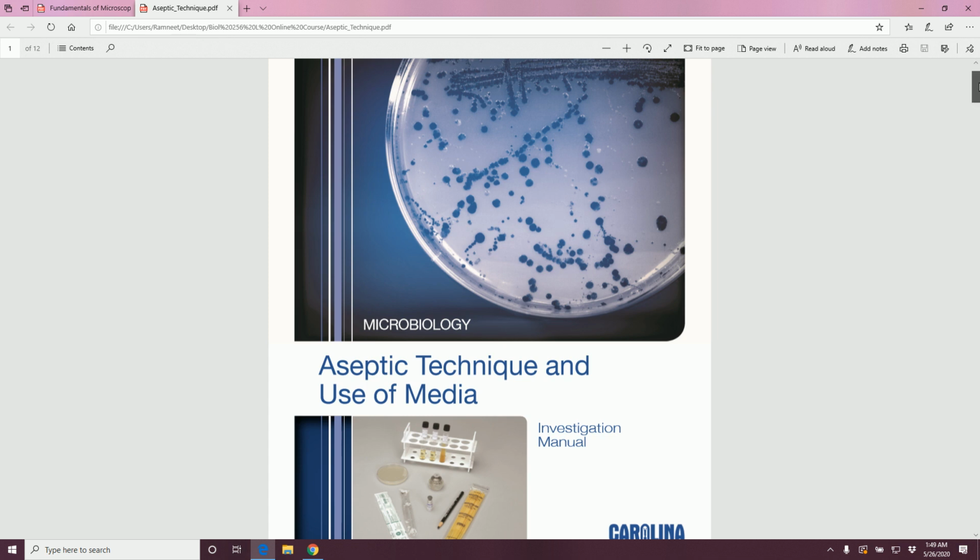So first of all, I would like to tell you what aseptic technique is and a few more terms, and then I'm going to explain what activity you're going to do in this lab. And also I would like to tell you, in all these Carolina worksheets, there are very good videos already embedded. Please watch them. Especially for the aseptic technique, they have made wonderful videos. You must watch them. That's a great demonstration. They'll be very useful to you to learn these basic microbiology skills.